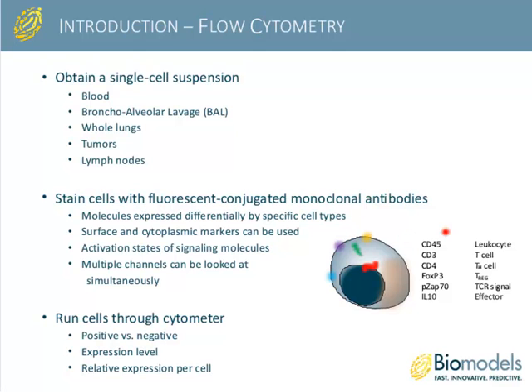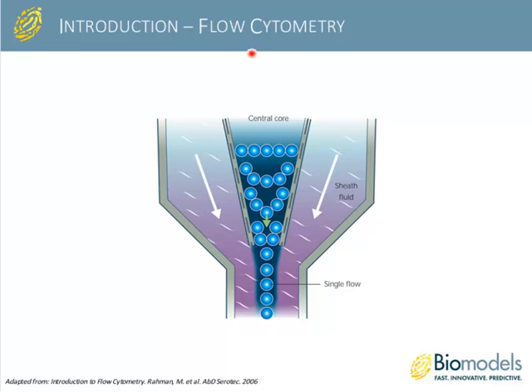So if our cell was positive for all 6 of these markers, it would be a pretty safe bet that we're looking at an antigen-specific Treg that is able to produce immunosuppressive cytokines. So flow cytometry itself, this is obviously a very, very simplified schematic.